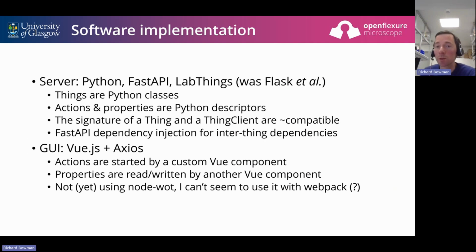To give perhaps slightly more detail on the implementation of all this, we're now using FastAPI for the Python backend. That's a recent change. The software has mostly been done using Flask as our web library, and then added in Marshmallow for managing types and generating schemas.